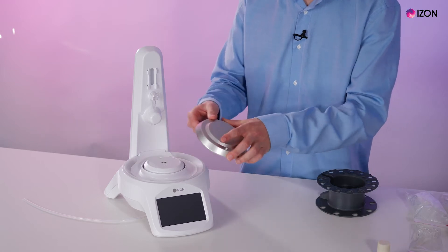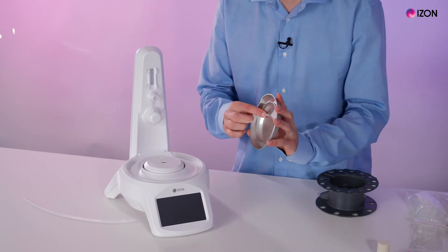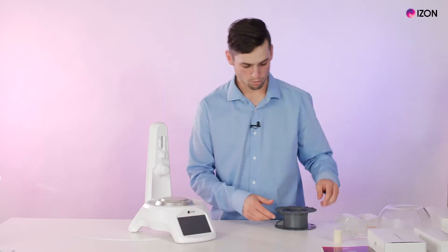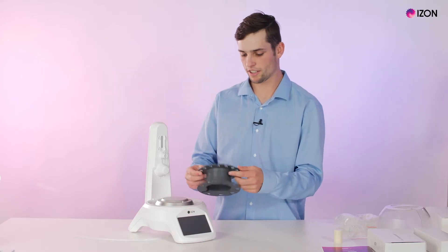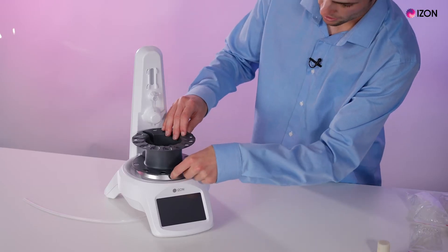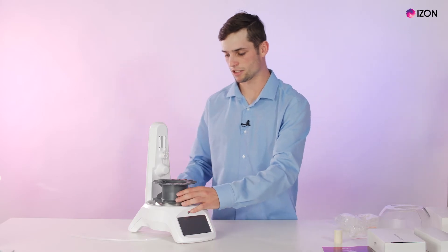There is an indent on top of the AFC and a protrusion on the bottom of the carousel plate which slides into and connects up. Once that's ready, there are indents on here with another protrusion on top — you just connect it up and that's the carousel all set up.